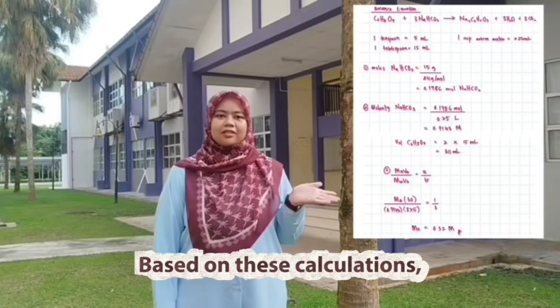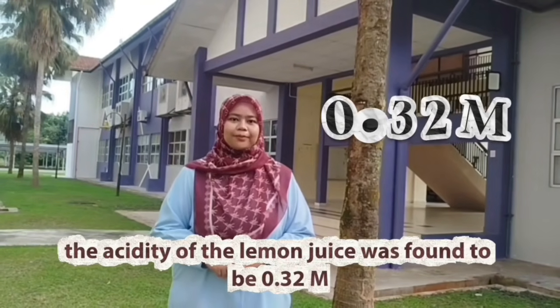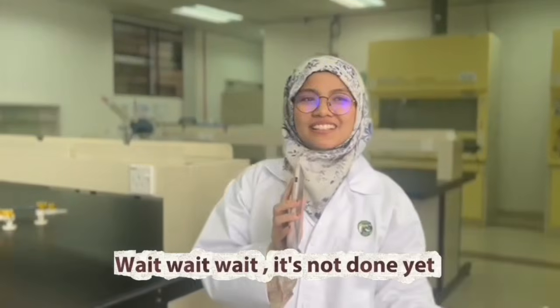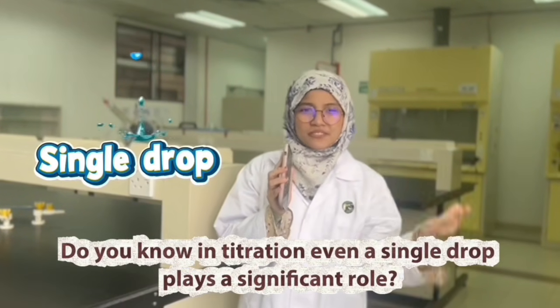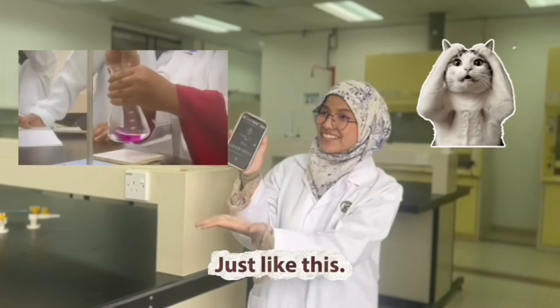Based on these calculations, the acidity of lemon juice was found to be 0.32 M. Wait, it's not done yet. Do you know, in titration, even a single drop plays a significant role. A tiny amount can affect the final result, just like this.